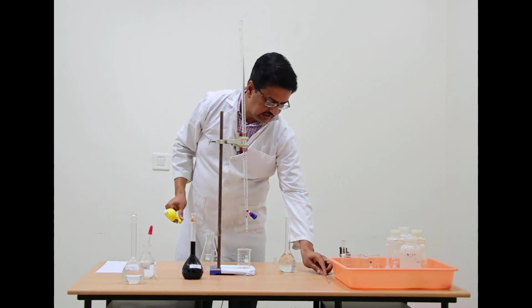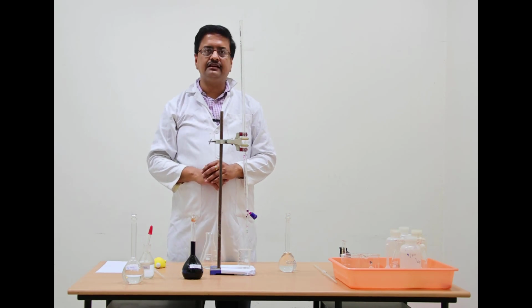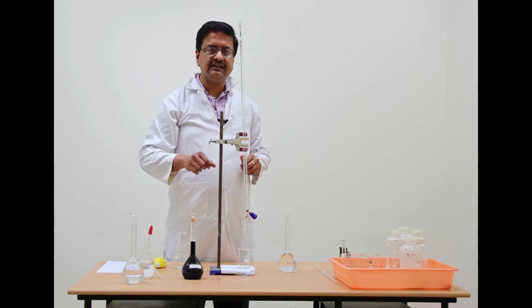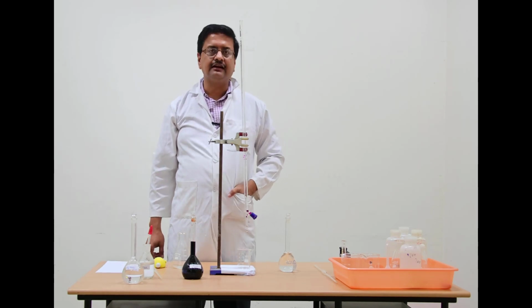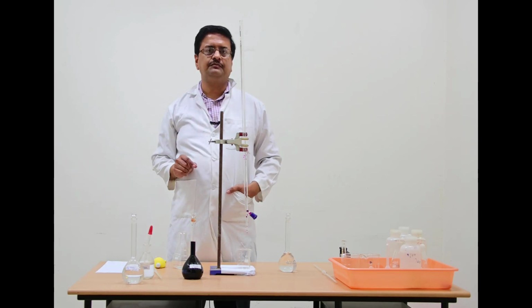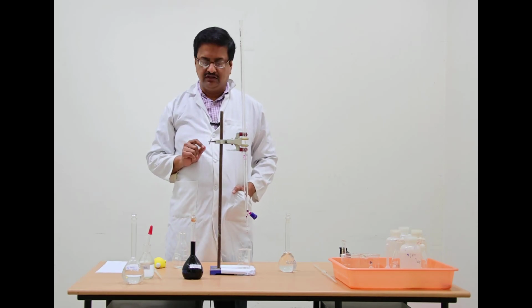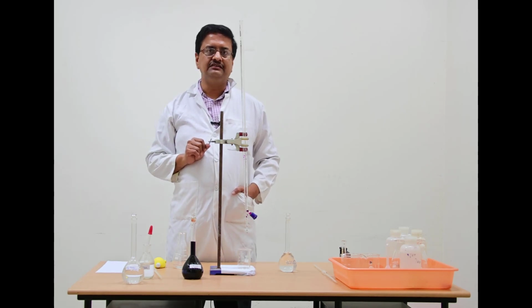So now the next step is to heat this solution to about 70 to 80 degrees centigrade on a heating mantle. While this solution is being heated, we will fill this burette with potassium permanganate solution. As you know, this potassium permanganate is a colored solution. So when we fill this burette with potassium permanganate, we should always note the reading of the upper meniscus for a colored solution, whereas in case of a colorless solution, we always should note the lower meniscus.